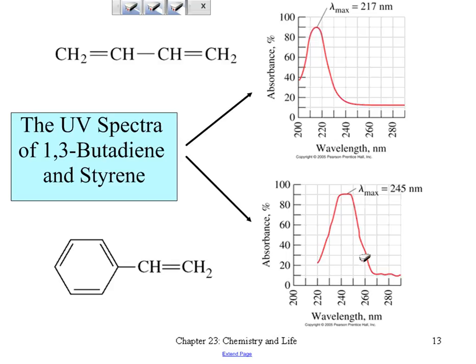There are certain amino acids that absorb at 280 nanometers, and if they know how much it absorbs, people can actually calculate how many amino acids of tyrosine are in that large protein.